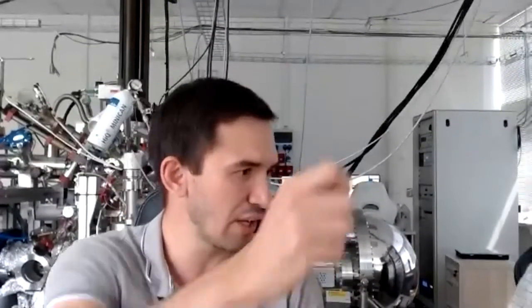When you put the sample in, can you load only one sample at a time, or can you load several samples to the load chamber? To the load lock chamber, we can load many samples, but for NAPXPS we can load only one sample. Yes, I know that, but you can store them in the load lock chamber, one by one. Yeah. Actually, Brad here now has a notebook, so he can move it and maybe show you.